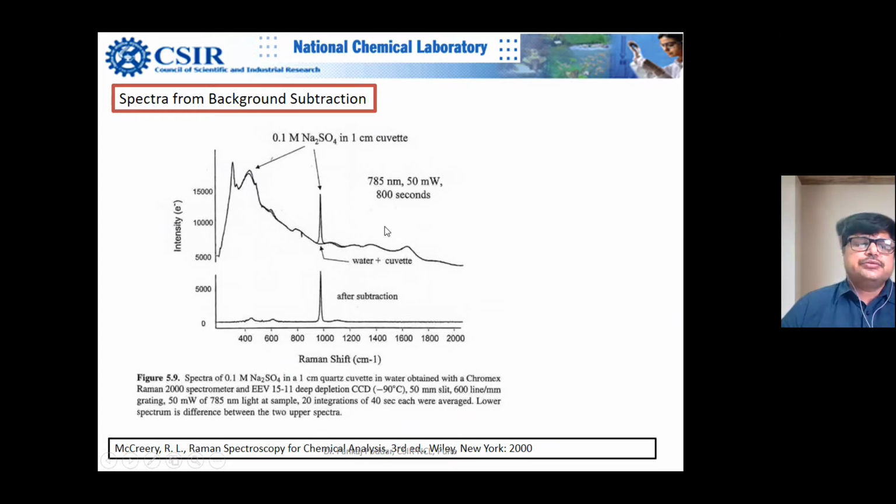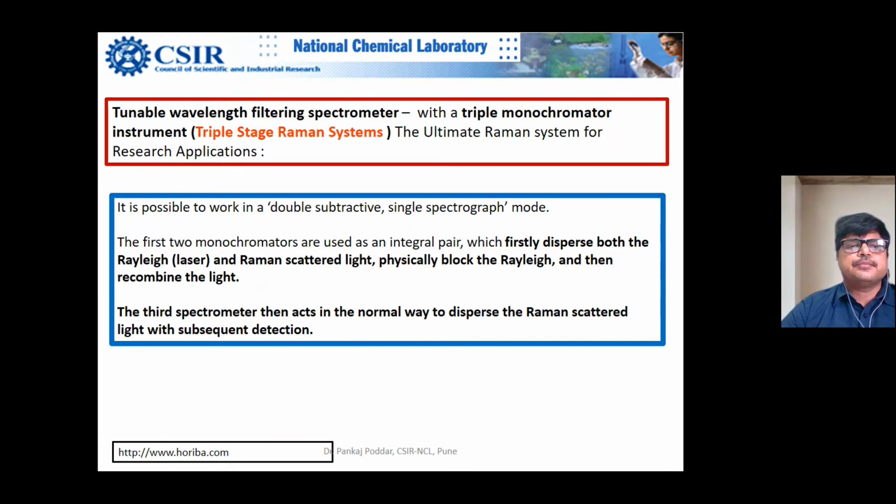It is less likely that you damage the molecules, because water will have its own heat capacity and thermal transport capability, so the molecules may not heat that much. But if you are focusing on a solid substrate on a tiny area, then many times there are irreversible damages to the system. Because of water and cuvette, etc., you have a lot of background, so it's better to remove the background. In the software, there is a provision that you can do that.